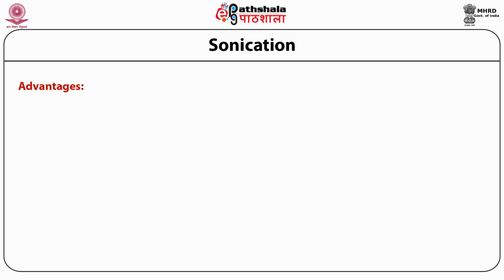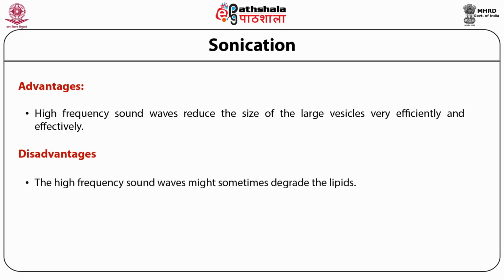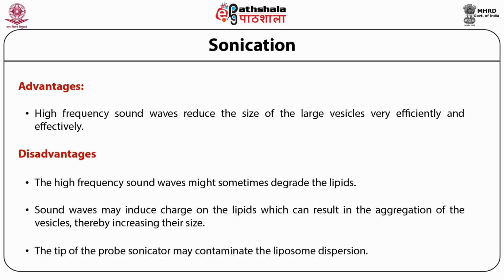Advantages of sonication. High frequency sound waves reduce the size of the large vesicles very efficiently and effectively. Disadvantages of sonication. First, the high frequency sound waves might sometimes degrade the lipids. Second, sound waves may induce charge on the lipids, which can result in the aggregation of the vesicles, thereby increasing their size. Third, the tip of the probe sonicator may contaminate the liposome dispersion.